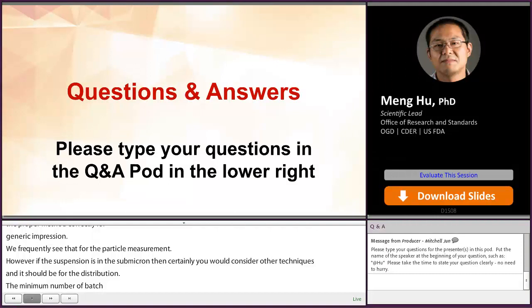So regarding the question, how much deviation is allowed? As I described in the slides, after calculating the EMD value, we apply PBE to test the EMD values from the group of test and reference. Then the allowance will be represented in the statistical testing. So PBE does its work to differentiate whether two groups of EMD are acceptable for BE or not. Thank you.